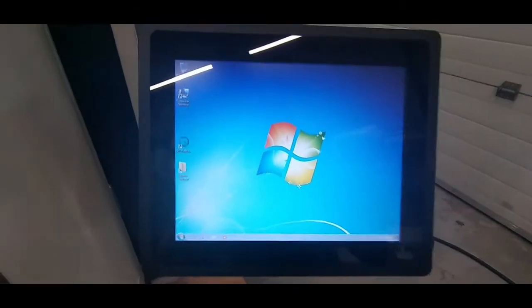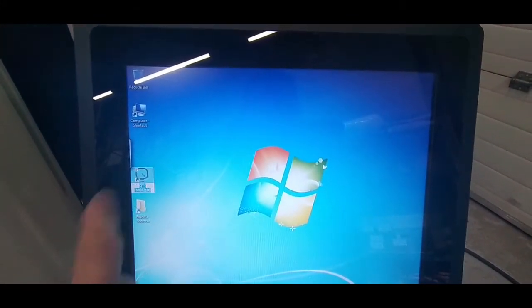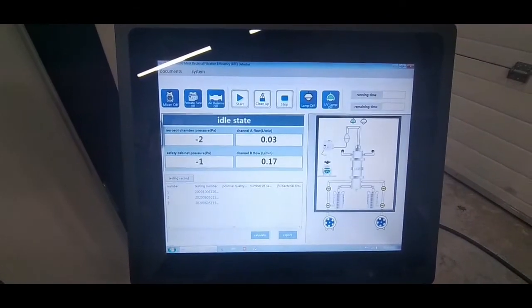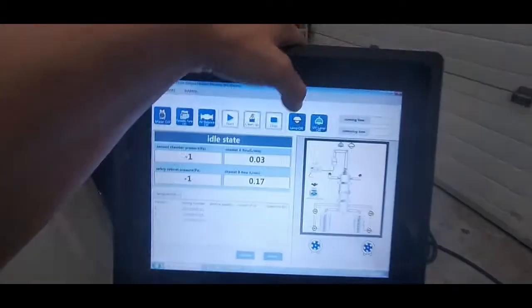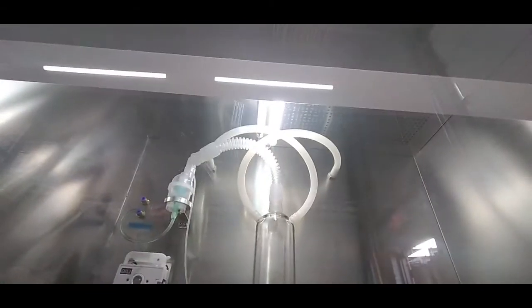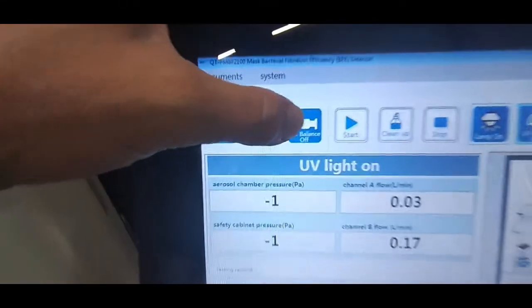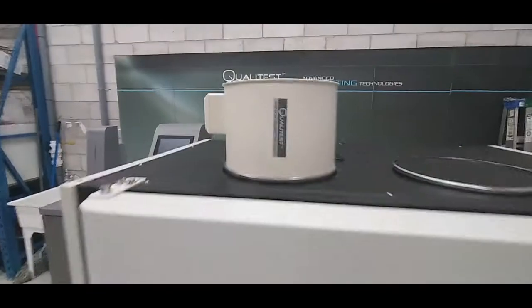Now onto the software. Invoke the software by choosing the icon and double-tapping. Turn the lamp on, then the air balance. You can hear the fan starting to rotate.